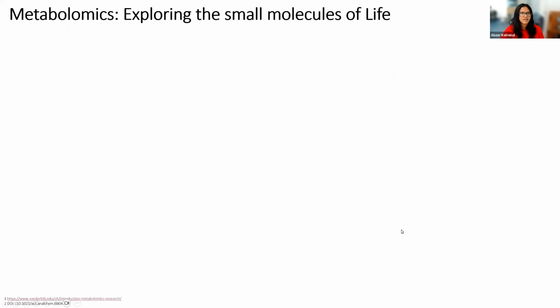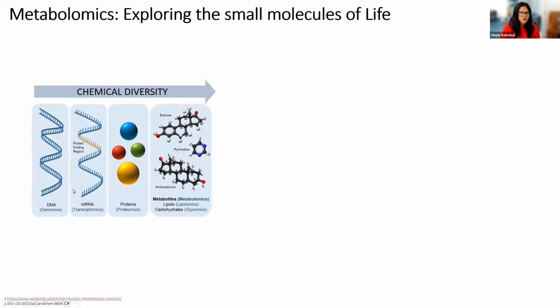Before going into the stats guide, I just want to give a short introduction. In metabolomics, I don't want to go deep into it, I guess most of you already know. We study metabolites, which are pretty much the end products of cellular processes, and with which we can get an overview or a snapshot of what's happening in these biological samples.